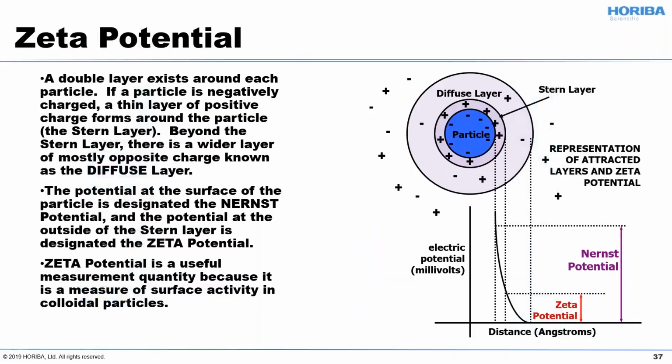Charging the particles up brings in the concept of Zeta Potential. And the Zeta Potential is the surface charge at the shear plane. So if you have a particle and it's charged, you'll have kind of a Stern layer of counter ions attached to it, so the charge potential will go down somewhat. And then you'll have the particle and those things moving around, and the rest of the liquid is an approximation. And that plane between the particle and what moves with it and the rest of the liquid, you find the charge, and that is the Zeta potential. It's a very useful concept when you're thinking about electrostatic stabilization.